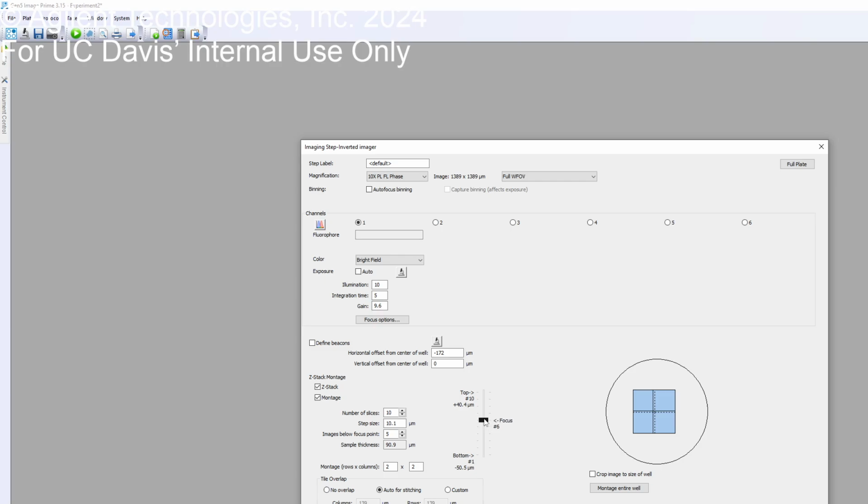So now you're going to focus, take 5 images below that and 4 images above that. It's a pretty comprehensive 3D image. If you have some 3D sample, then you can do that. I didn't get what the role of this one is. If you start on the top, what does it come from?